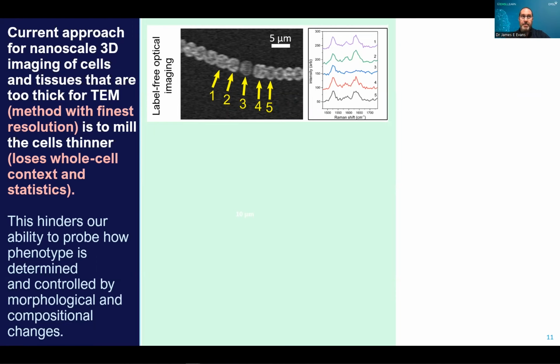In particular, PNNL has imaging systems that directly visualize 3D ultrastructure without labeling at resolutions greater than 1 micron and less than 10 nanometers. This means that we were unable to visualize whole living organisms intact and label-free with nanoscale spatial resolution to fully understand their internal organization, composition, and cellular changes in response to environmental perturbations. For example, what is happening morphologically to thylakoids or chloroplasts when photosynthetic organisms go through a diel cycle.